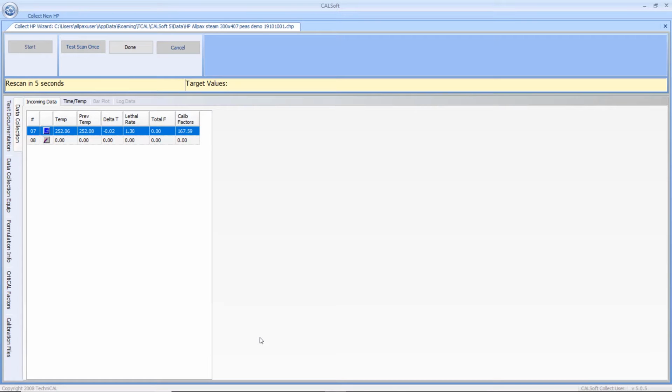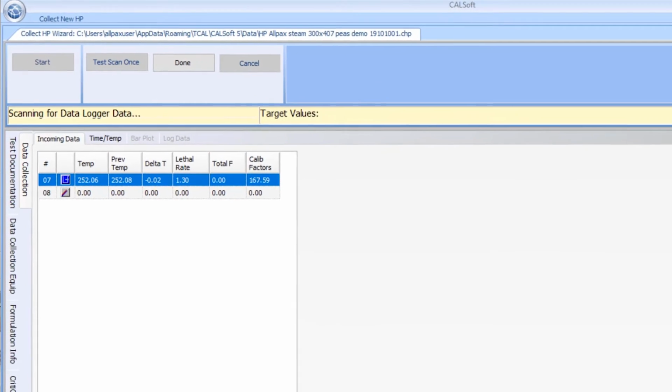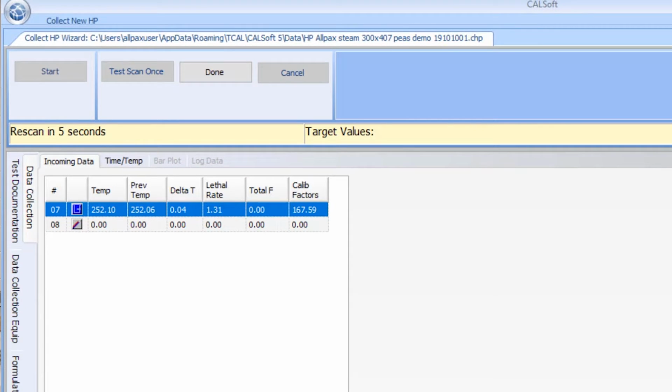And it's just feeding me temperatures, and they're not being saved. They're just being read. So what it's doing right now, if there's a thermocouple there, it would be reading the 7 and the 8. Now, what I also do is I always check this number here, and I make sure that I have exactly the right number of thermocouples and that they're all correct and that the free lead is correct.